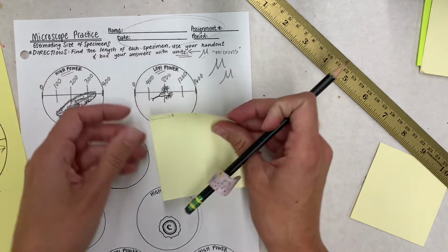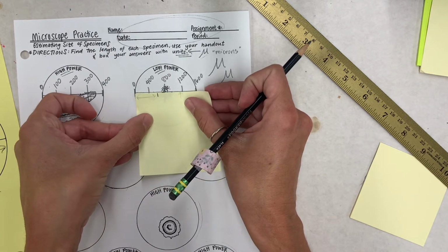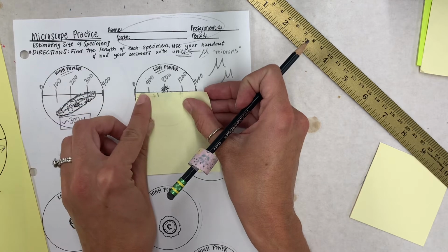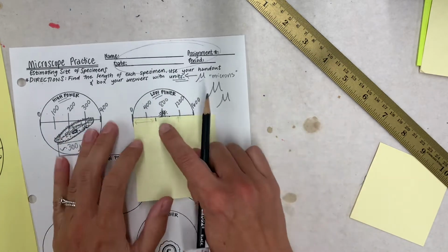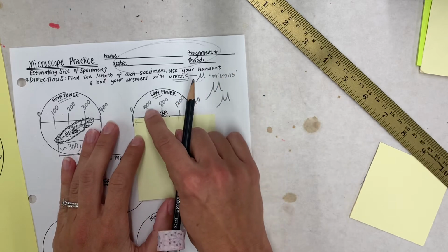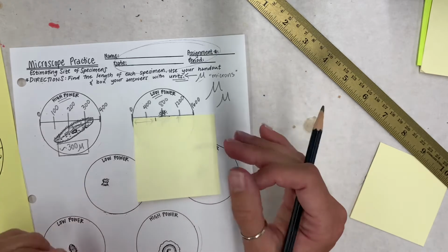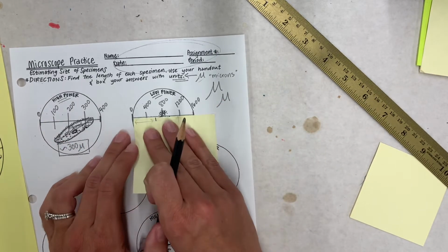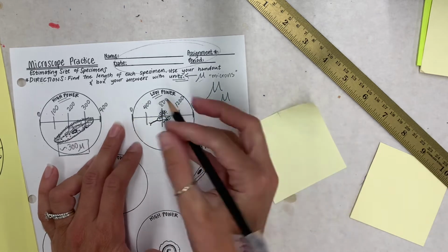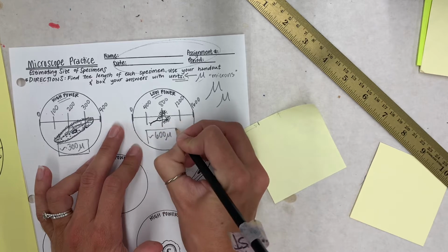Peel that up, compare it with your marks. And it looks like it is about halfway, maybe a pinch more, between 400 and 800. So there is room for some error here, but we should be getting approximately the same estimates. So in this one, I'm going to say this one is about 600 microns long.